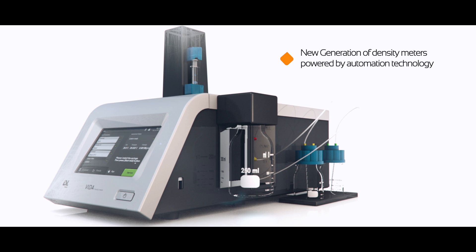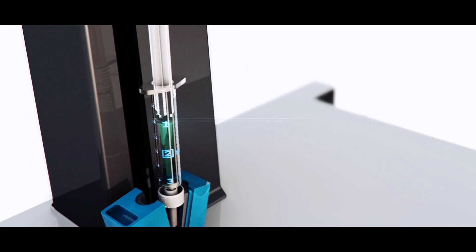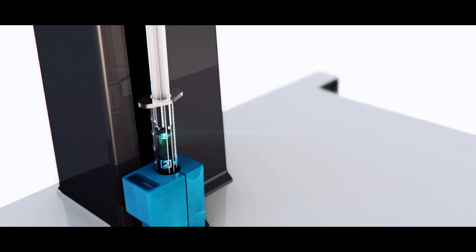Vida is powered by this technology, but with backup of smart and innovative features to eliminate any bias errors due to incorrect filling or the need for visual inspection by operators.